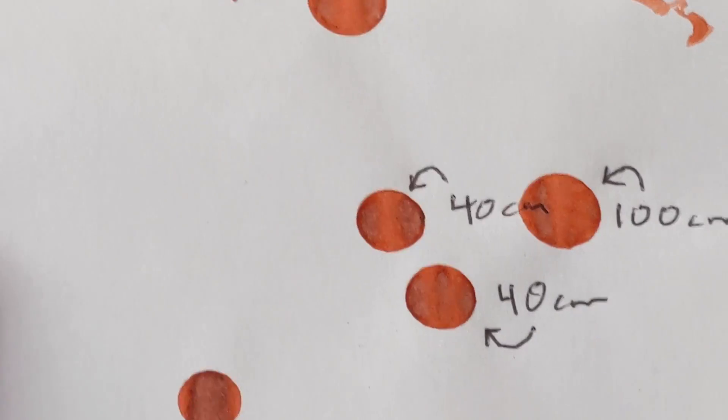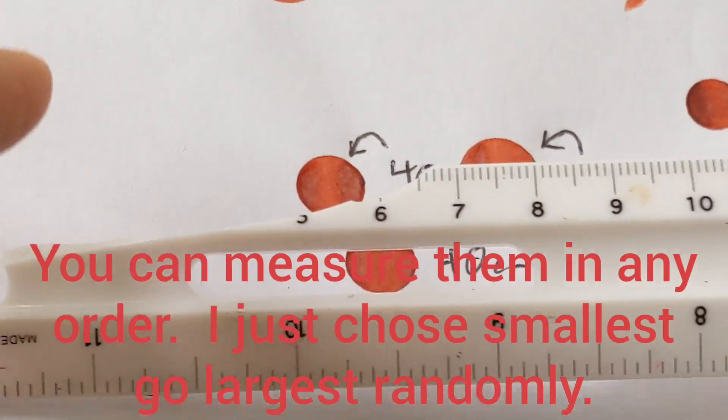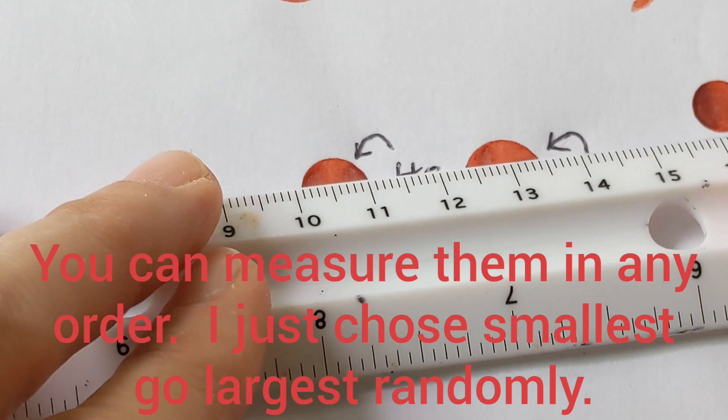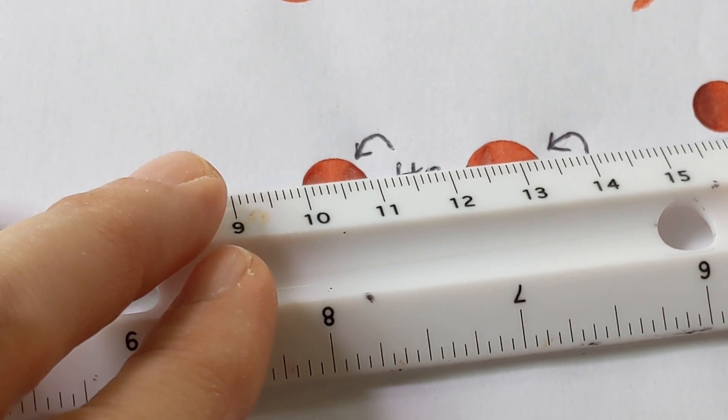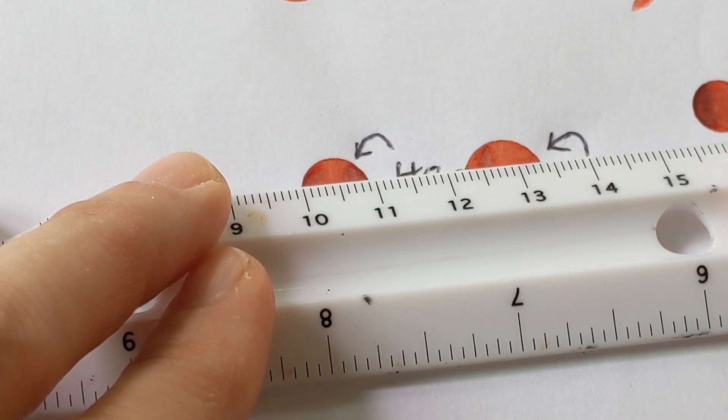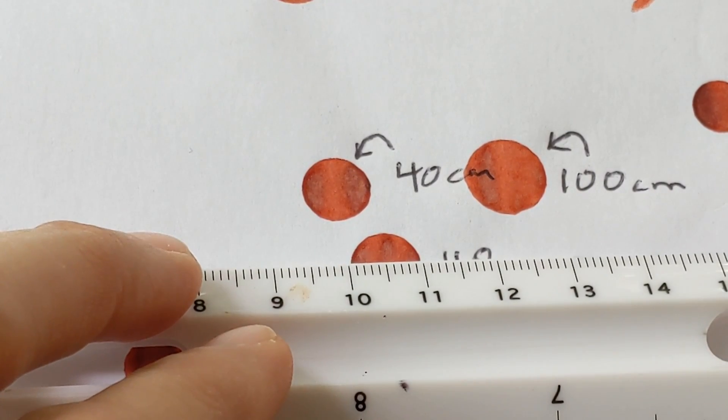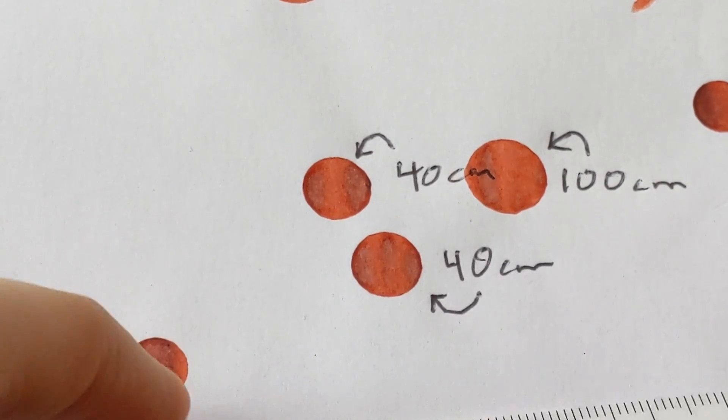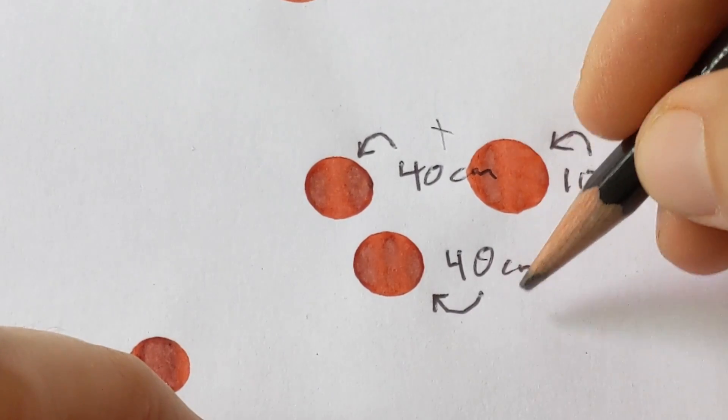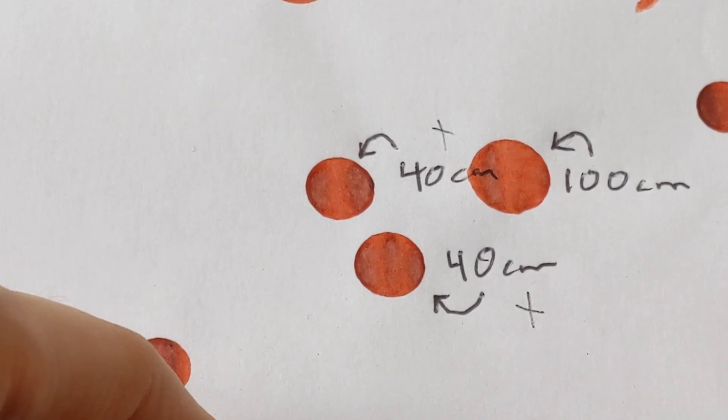Now I'm going to move to my 40-centimeter height droplets, and I seem to have two good droplets from 40 centimeters. It looks like this one is about 9 millimeters, and this one's also about 9 millimeters, so that's good. That means we have precision that the same height is ending up with the same diameter.